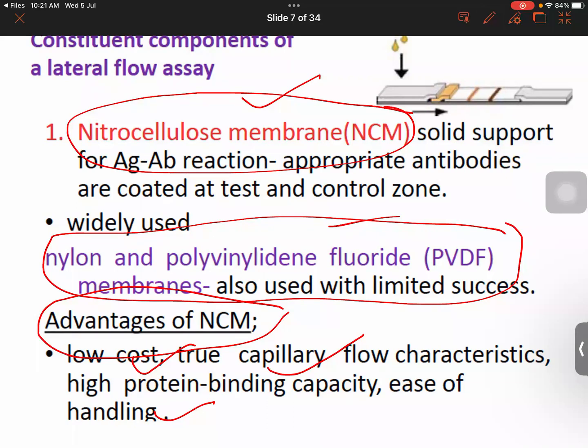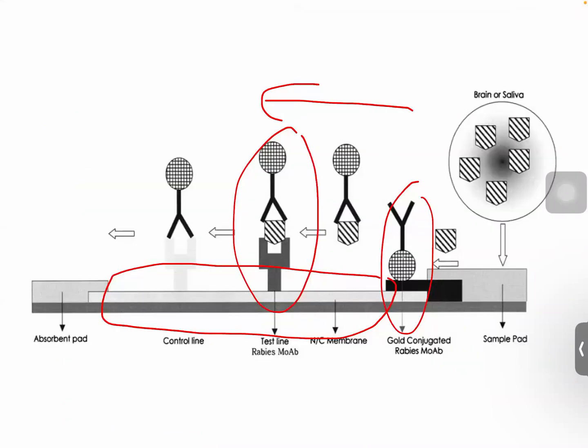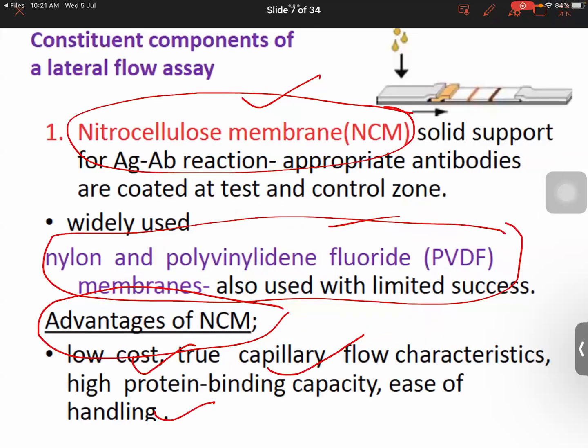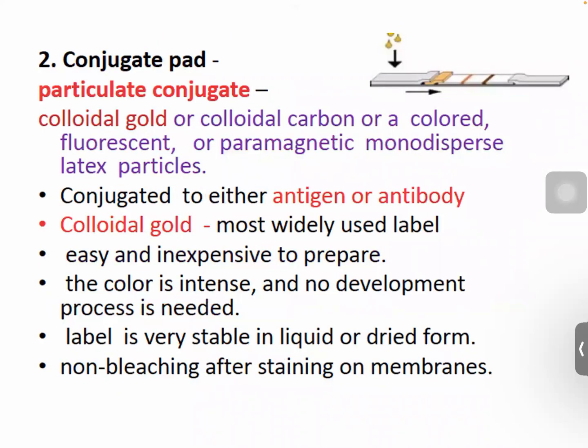This plays a big role actually, apart from the bioreceptors. The structure or the solid support of the lateral flow is very important to choose. This is based on our experience as well as based on my reading.